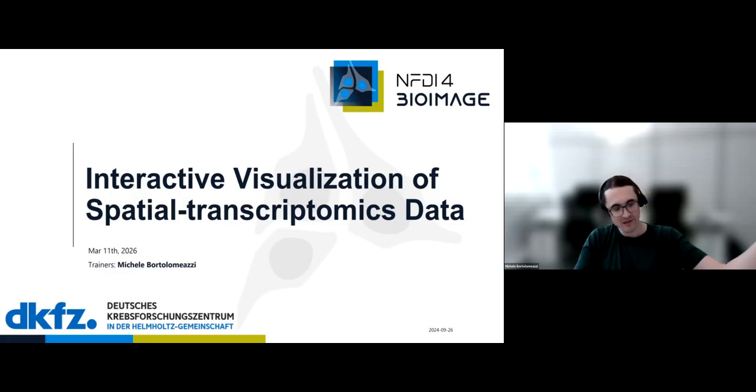We have tables and images and points and shapes. It's quite a complex data set and requires a more complex setup to really make the most out of our experiments.